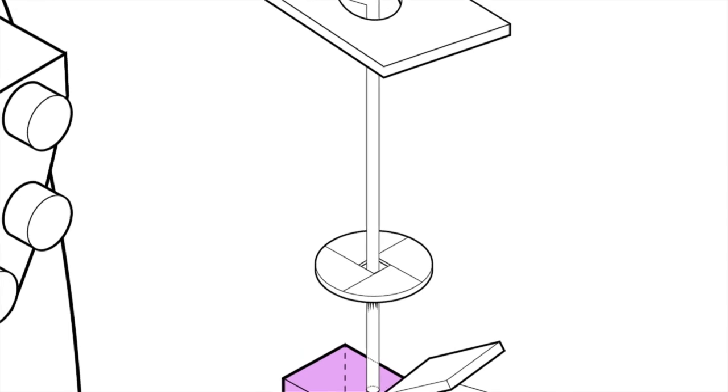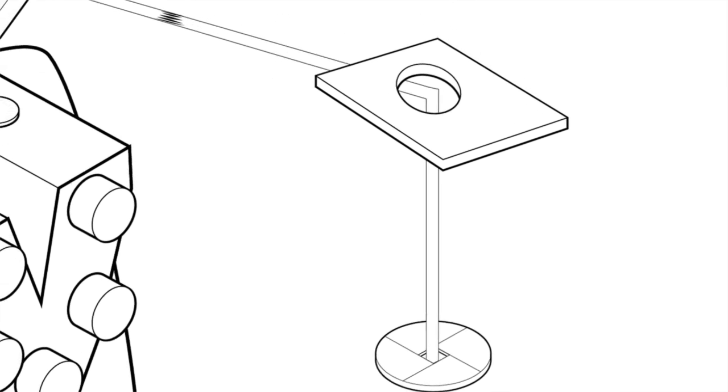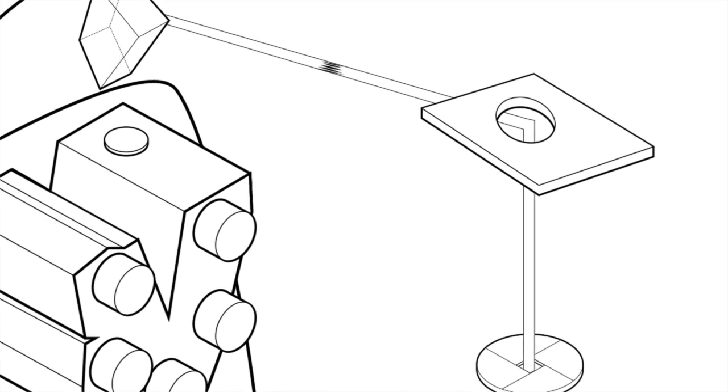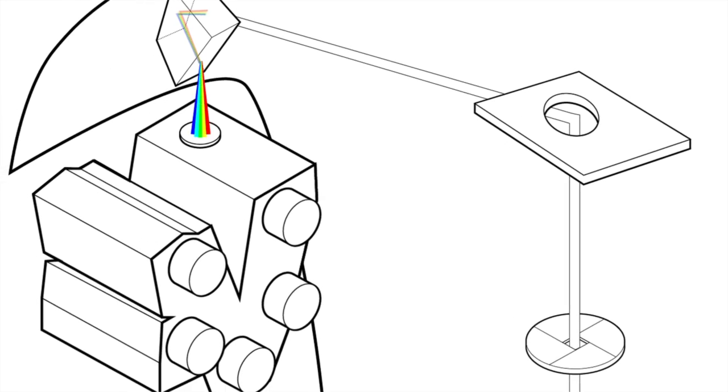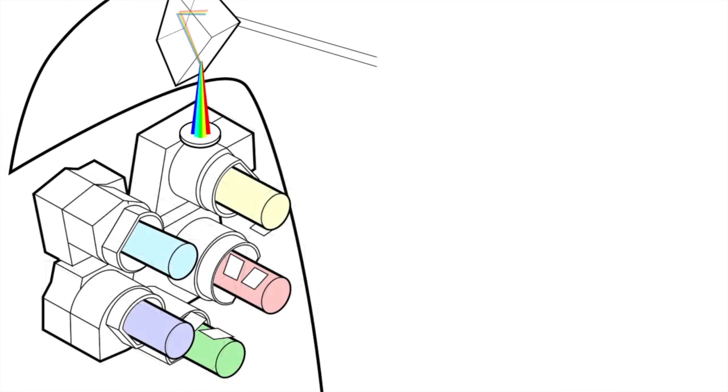Once past the beam splitter, the emission light reaches the Leica spectral detector system which provides highly efficient dispersion and detection of the full emission spectrum.